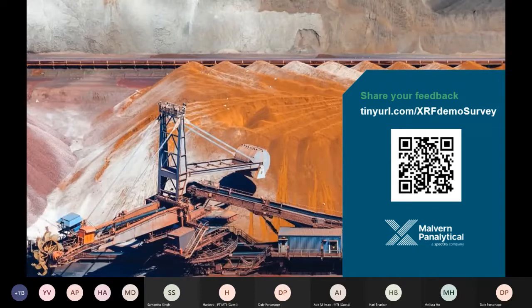So for just cobalt, magnesium, and silica, that analysis time could probably be a little over 1 minute, maybe just under 2 minutes, if that was the only 3 things you were looking at. Most of the counting time is spent on light elements because of the poor X-ray fluorescent yield, and it's hard to improve on that. It's just a function of the elements that you're analysing. And so if you were looking at an application that was only measuring iron, or even only iron and nickel, that could actually be achieved very quickly. You could have a result in under a minute.